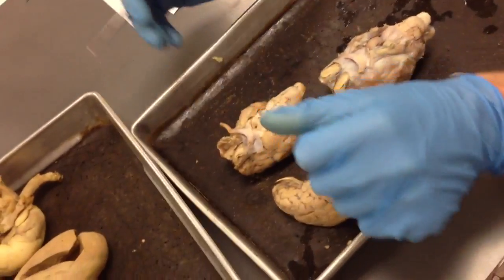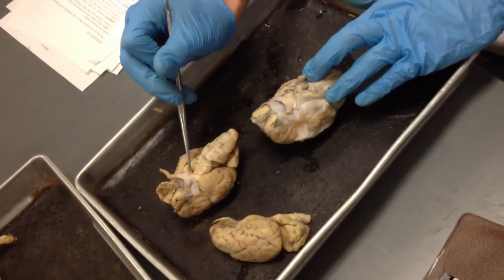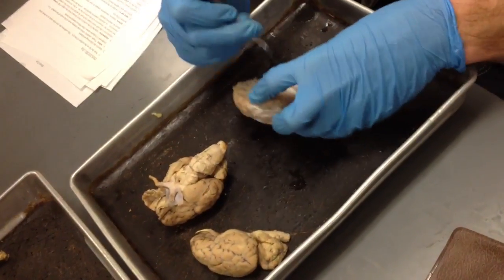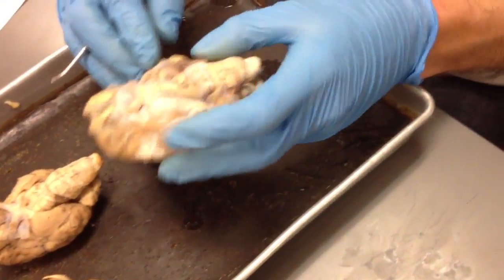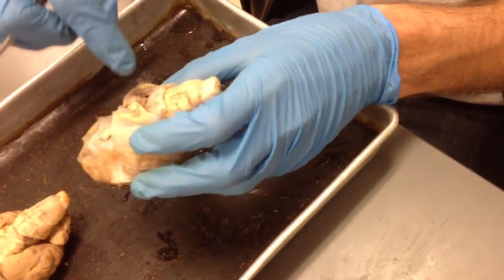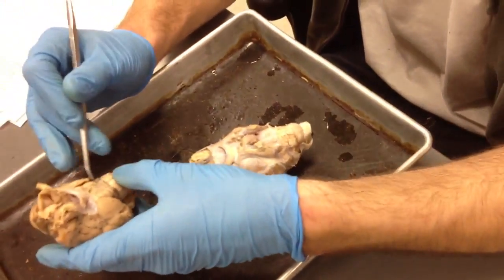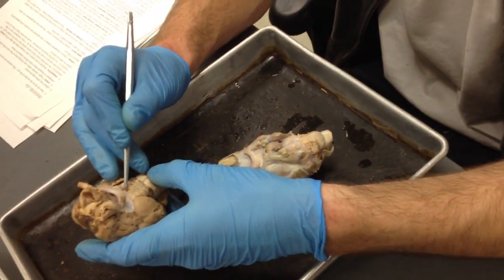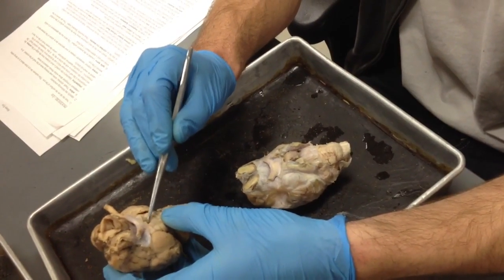You already went over the pituitary gland, right? Right, so the pituitary gland's right here. And what the infundibulum is, we don't have you guys dig around in here and try to find it because it would cause too much damage, but it's what connects the pituitary gland to the central brain. So all that we have left of it once we remove it is this nice little canal, the infundibulum.